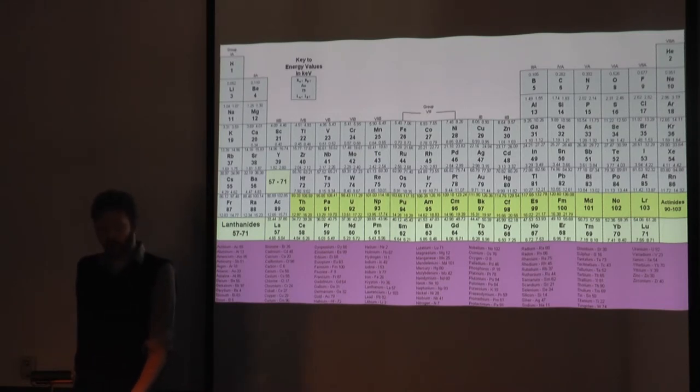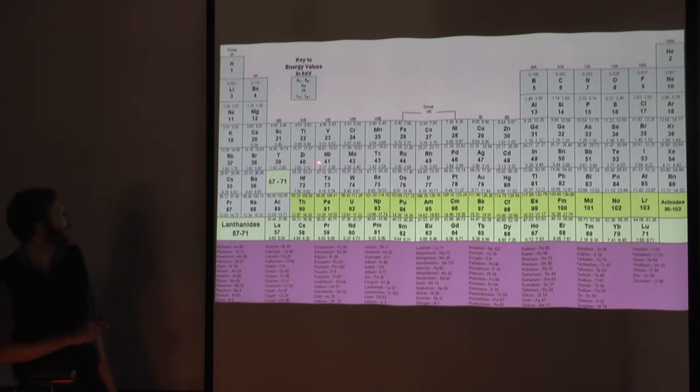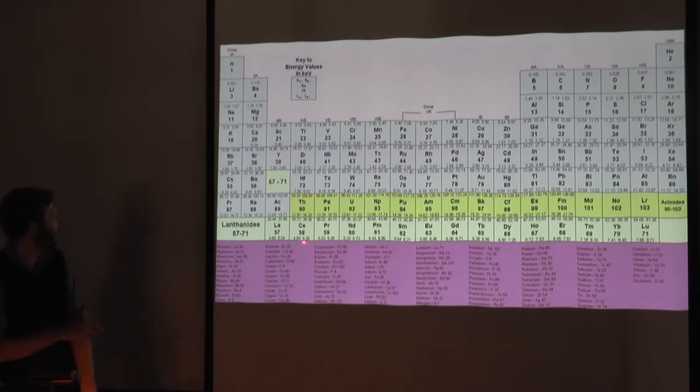We set the device to emit 40 kilovolts of energy at 12 microamps through Bruker's yellow filter. In other words, we limited ourselves to fluorescing elements between chromium and antimony in the K series. So chromium is here, 24, and antimony is there. So everything in between these for the K series. And anything heavier than praseodymium, which is right there, 59, so everything heavier than that in the L series.